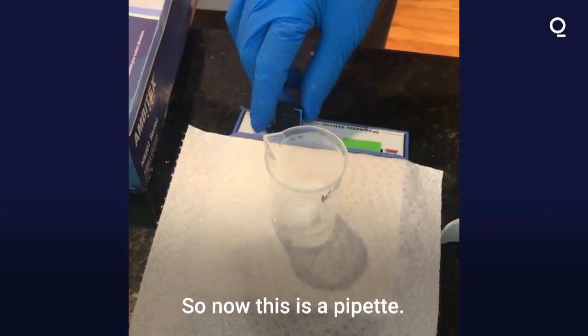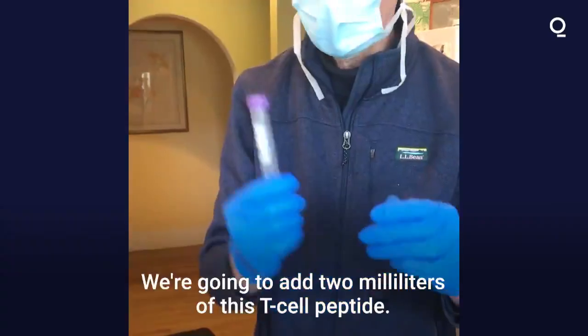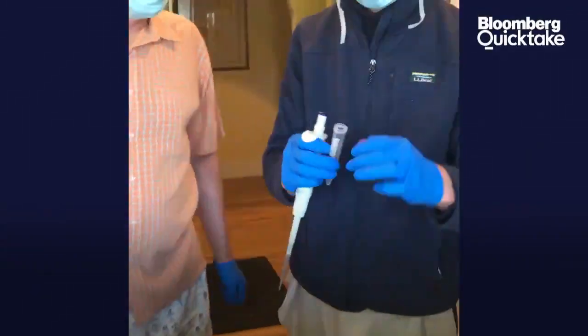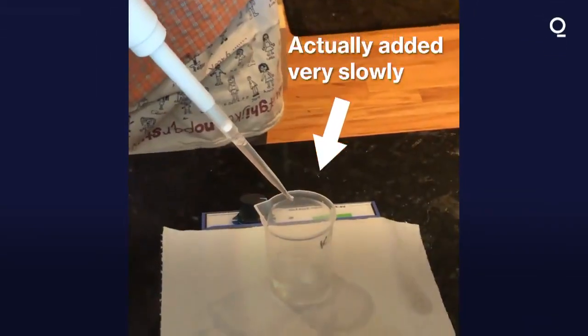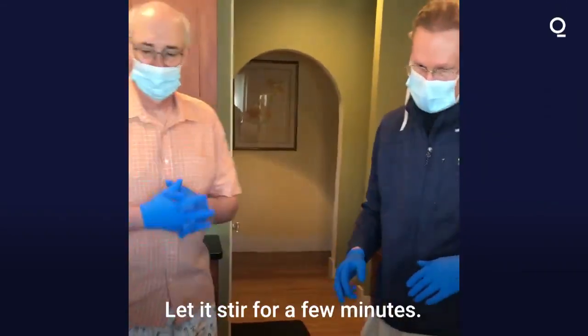So now this is a pipette — you can dial up very specific volumes. We're going to add two milliliters of this T cell peptide. Now we're going to add the ionic crosslinker with the B cell peptide. That is done. Covered up. Let it stir for a few minutes.